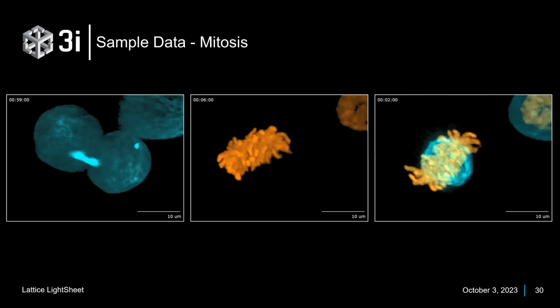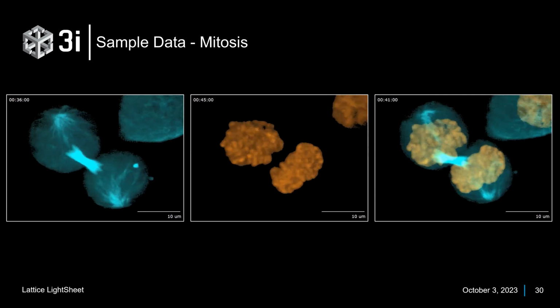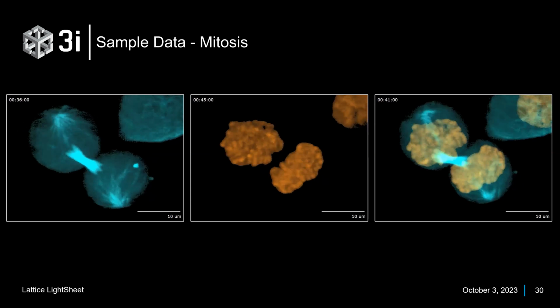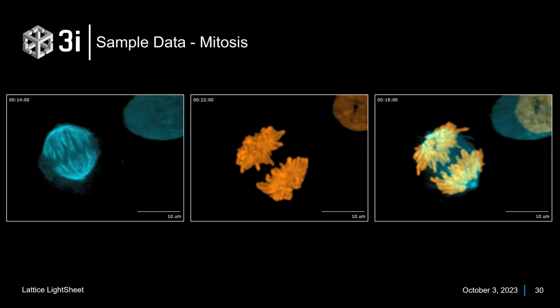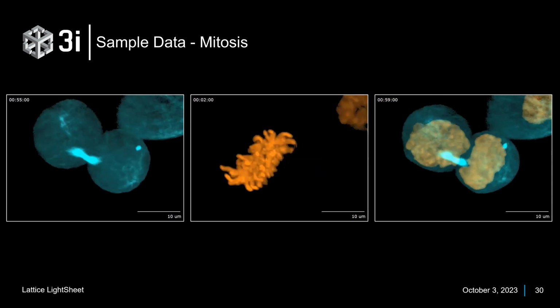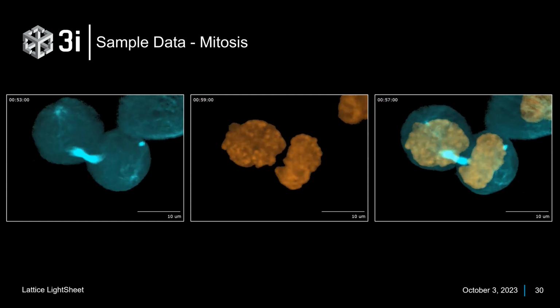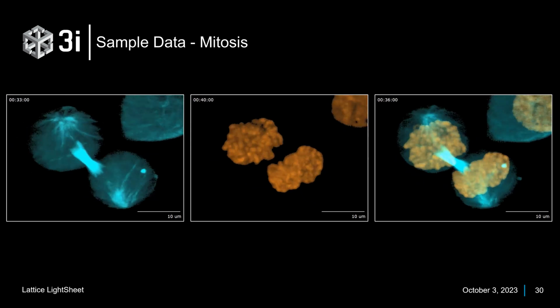As for the thickness, not as much. You can actually increase the Z stage has millimeters of travel that you can do. You're only ever going to image the top, but thin is good. This is going to sound sacrilegious, but we use #1 cover slips, not #1.5, because they're cheaper. It doesn't matter what the thickness is. Usually you'd be using a nice #1.5. You can treat them again with whatever you want. So just like you plate cells on them, you could put them in the dish, do a treatment on top of them, be it some sort of coating, be it some sort of receptor or fluorescent protein.